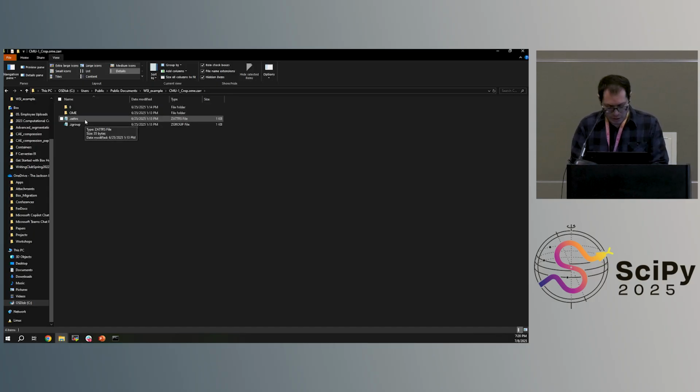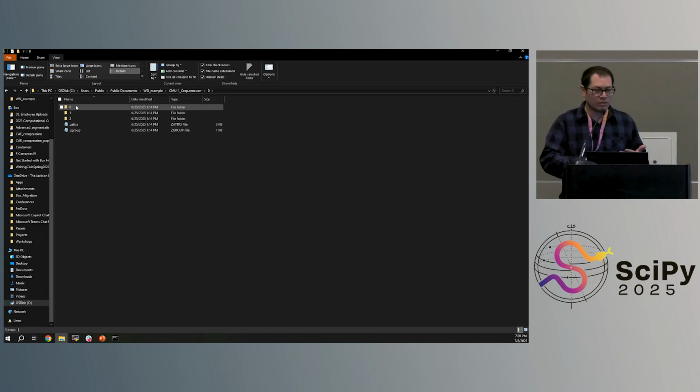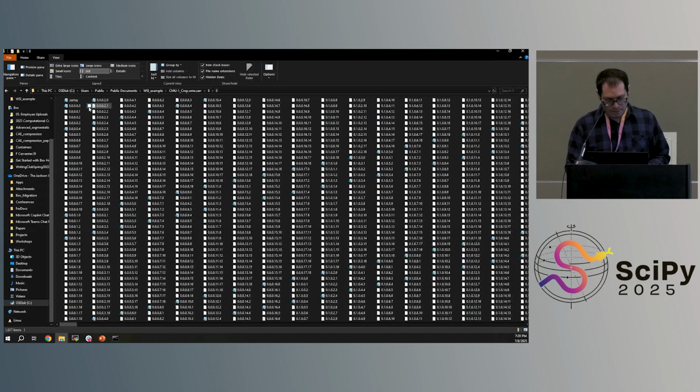So this DA gray is going to be a lazy operation applied to the selection that is going to return something that is now just a single channel image, and is preserving the size of that. And to show you that this is working, we can use plt show. I'm probably going to need to import this again. Import matplotlib pyplot as plt.